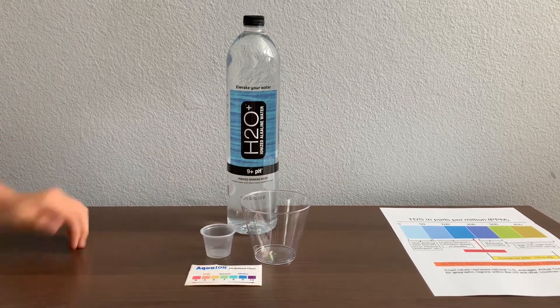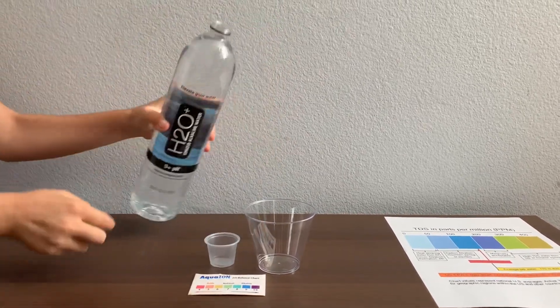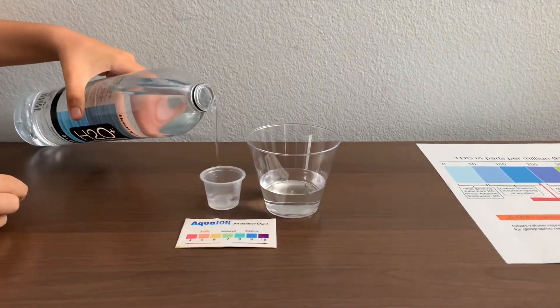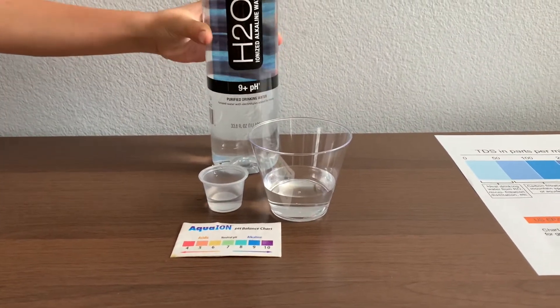Let's test the pH and TDS levels. Let's pour some water in. First, we are going to test the TDS level.